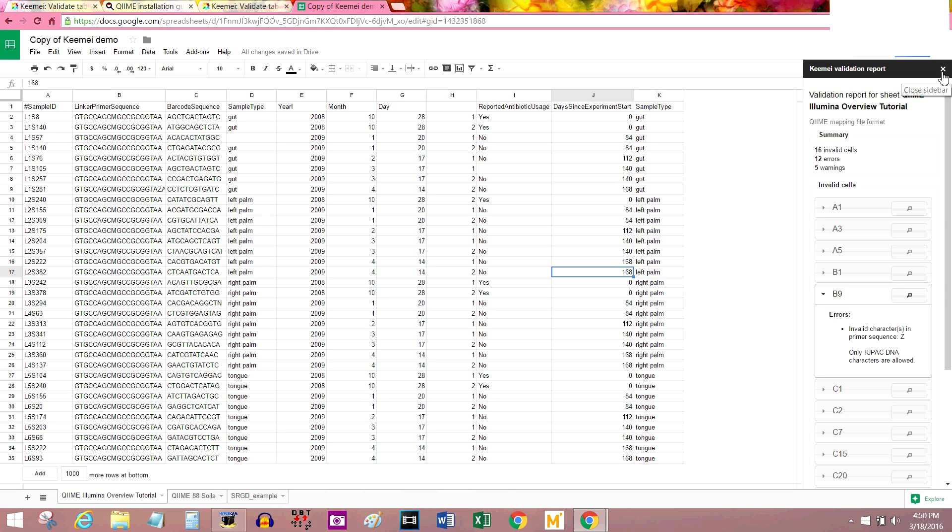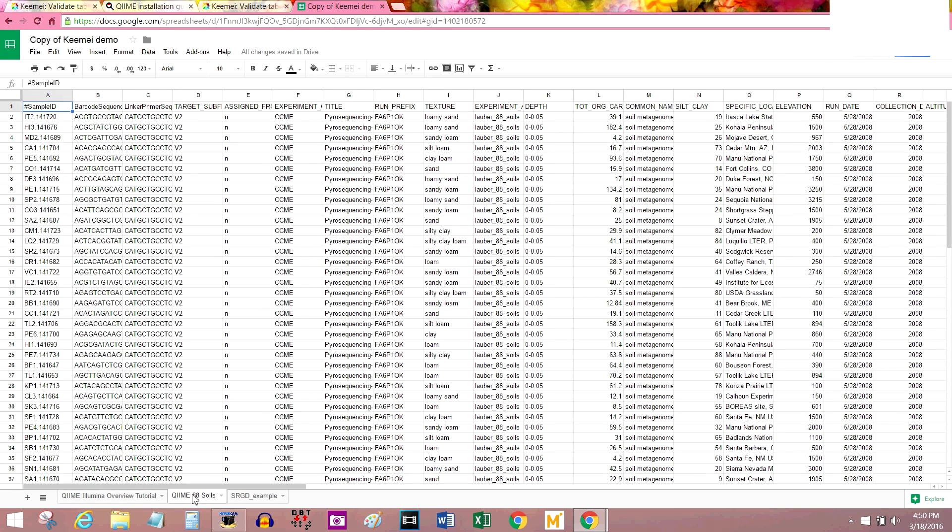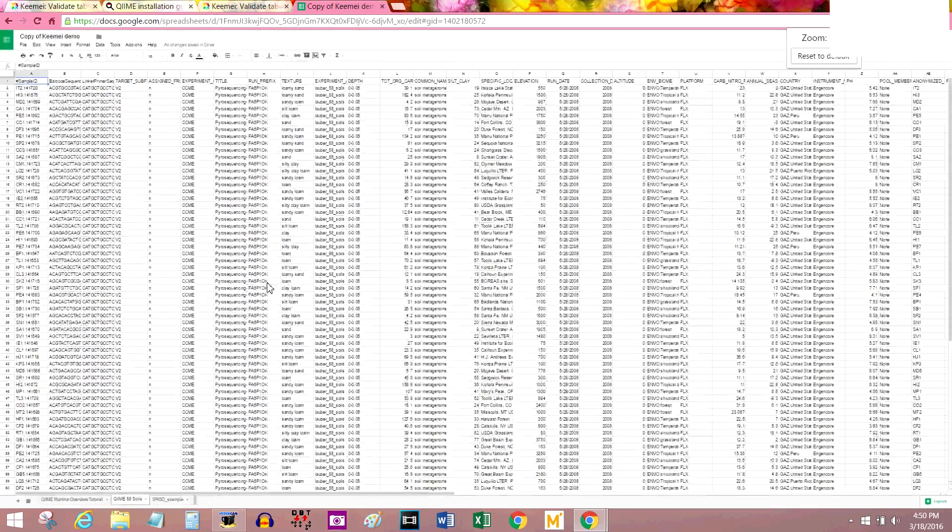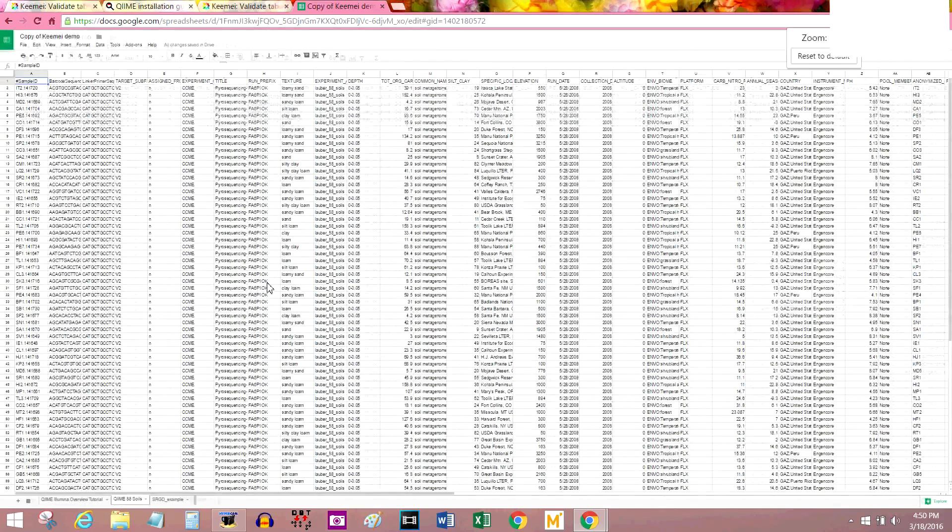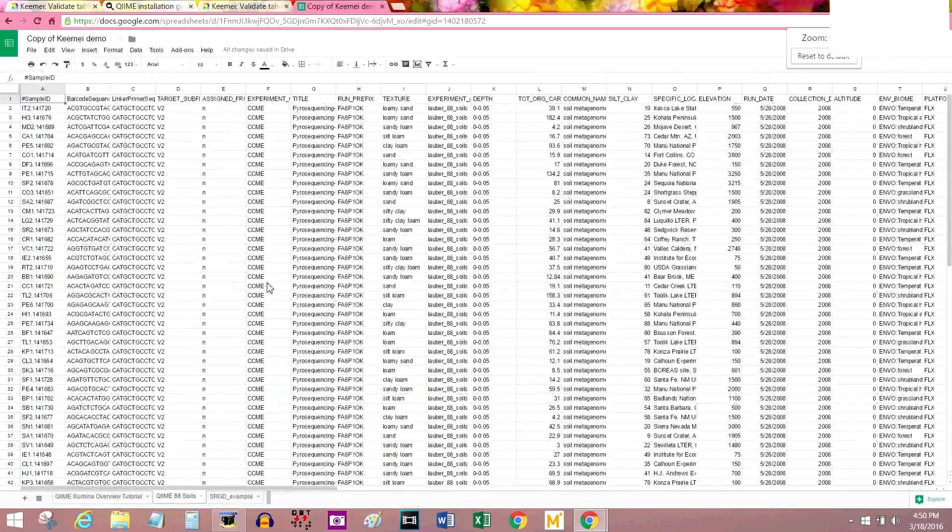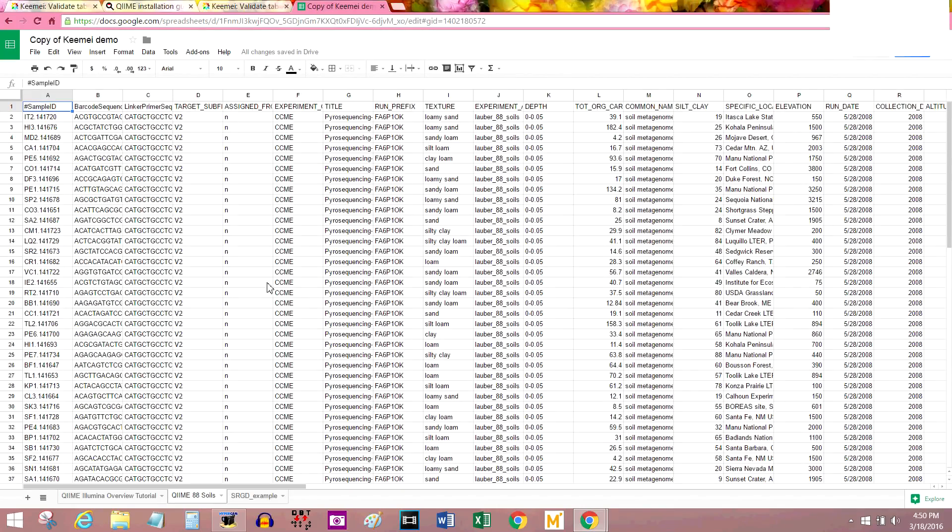I'm going to X out of this one and go over to this second tab. You can do this with me. This QIIME 88 soils tab. Now this is a huge file. Zoom out for a second. Look at that. It's gigantic. I could never personally go through every single piece of data in this. I mean, I probably could if I really wanted to, but it would take me forever.